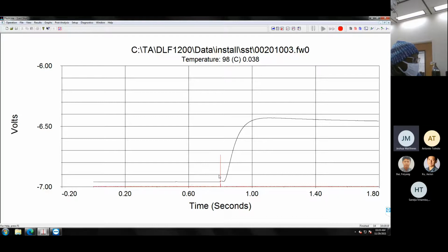If you look at your instrument, on the bottom is the laser electronics. In the middle there is the furnace, and at the top, that silver box, that's your detector. The laser fires at the sample, it heats the sample up, and it's measured how quickly it runs through the sample from the detector at the top.